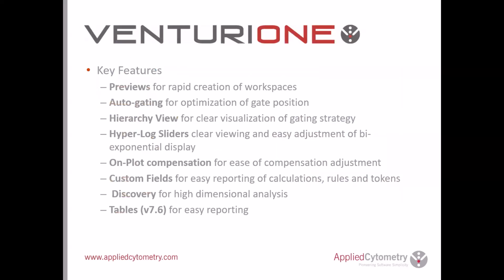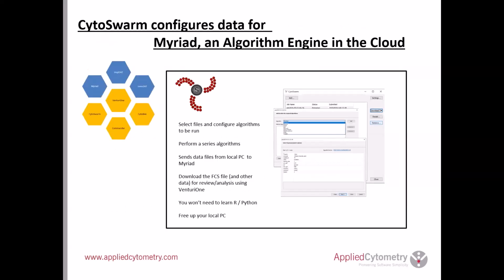VenturiOne has all the key features that you'd expect to see from a standard flow cytometry analysis software, and we'll be looking at that in action later on. Also today, we'll be looking at CytoSwarm.